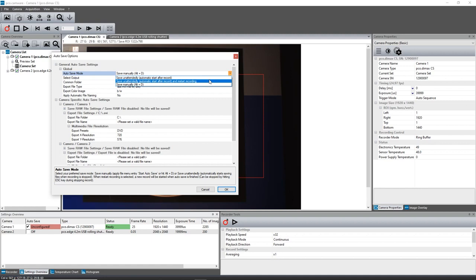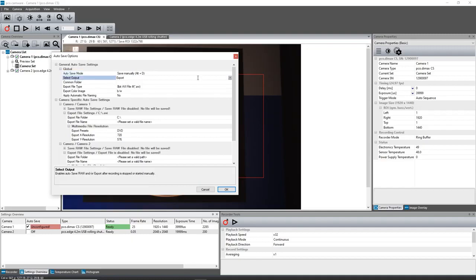With selecting Automatic Start after Record and Restart Recording, the recording restarts after every saving process. Be aware, this will start an endless loop of recordings. It can be deactivated by unchecking the Auto Save checkbox. Before using this function, you need to adjust its settings.